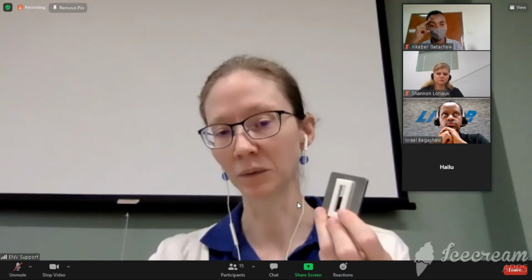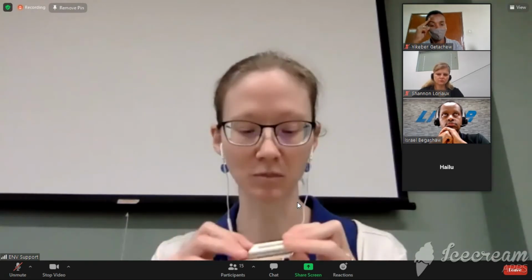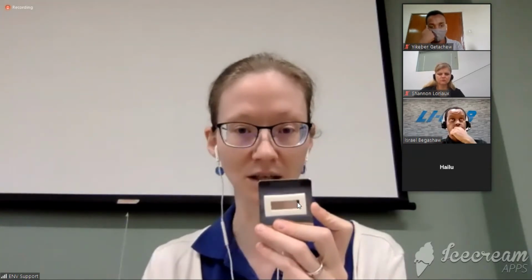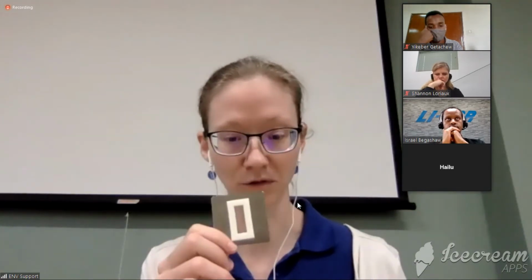If you are working with small leaves, especially small, narrow grass leaves, and you don't need to do fluorescence, you might find that using this one is pretty easy, because that means that we just have to worry about filling this small chamber, and we don't have to calculate anything. We don't have to worry about anything like that. So when you start to take your measurements, if you need fluorescence, change to the smaller aperture. Or if you don't need fluorescence, use just the small gas exchange chamber. And that will make your life a lot easier.